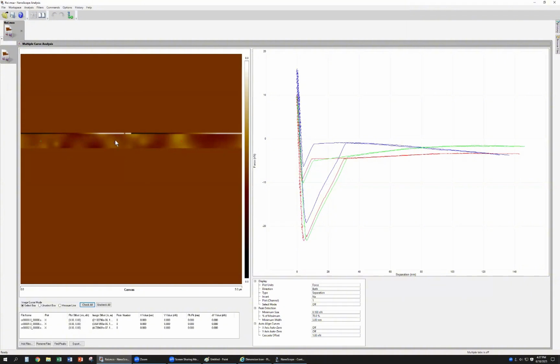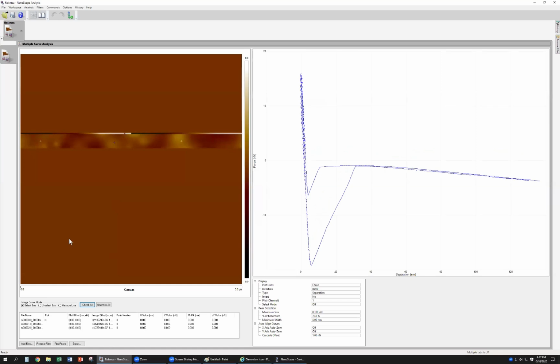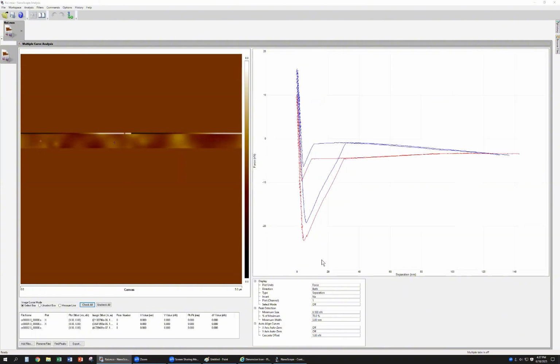This depends on the colors, one color fitting to one point. This cursor's color, if you only want to see one, this color is the middle one, the blue one. If you want to add another one, this red color one is the second point.